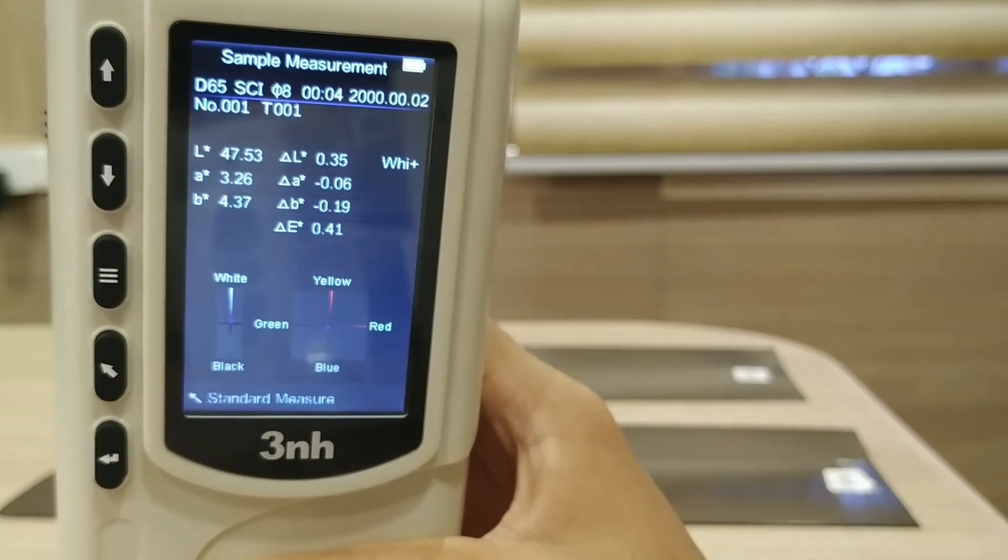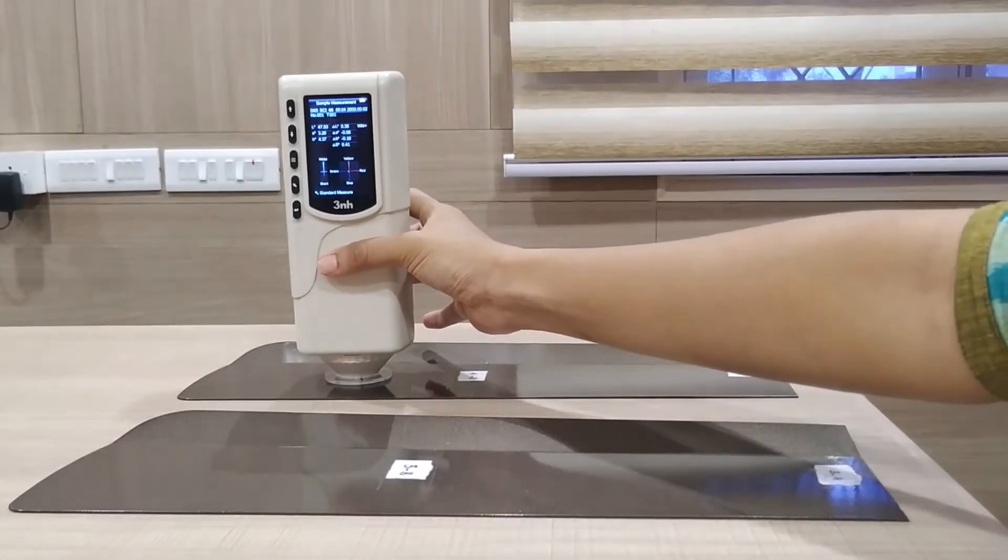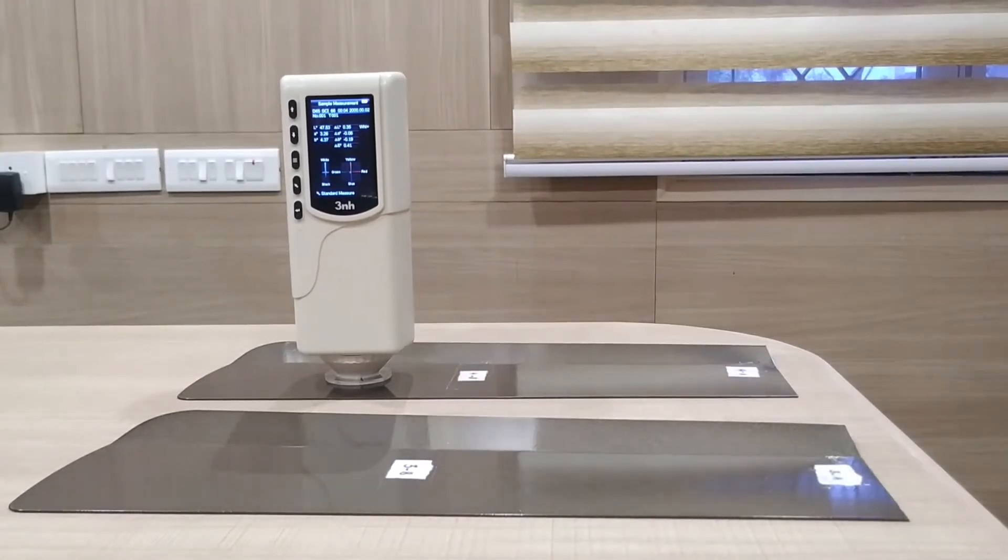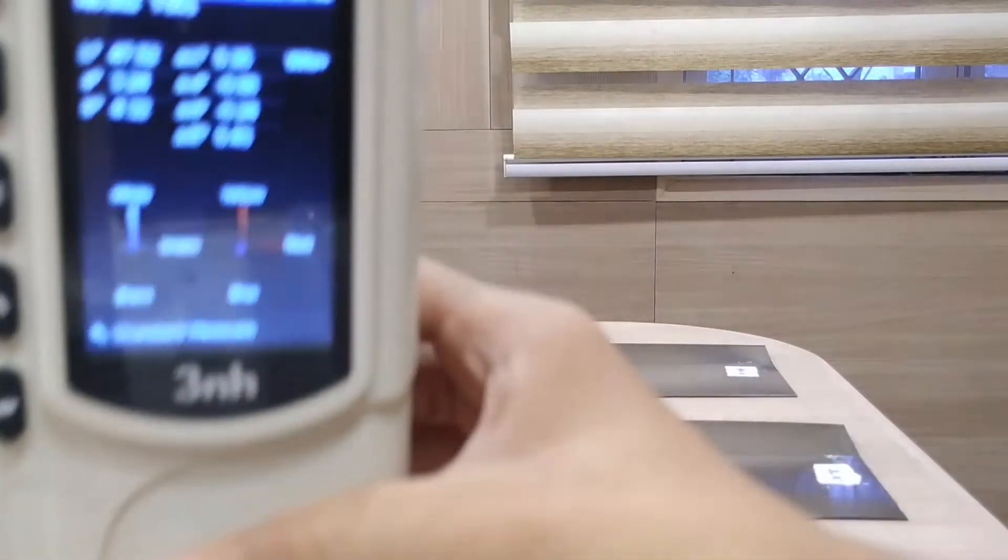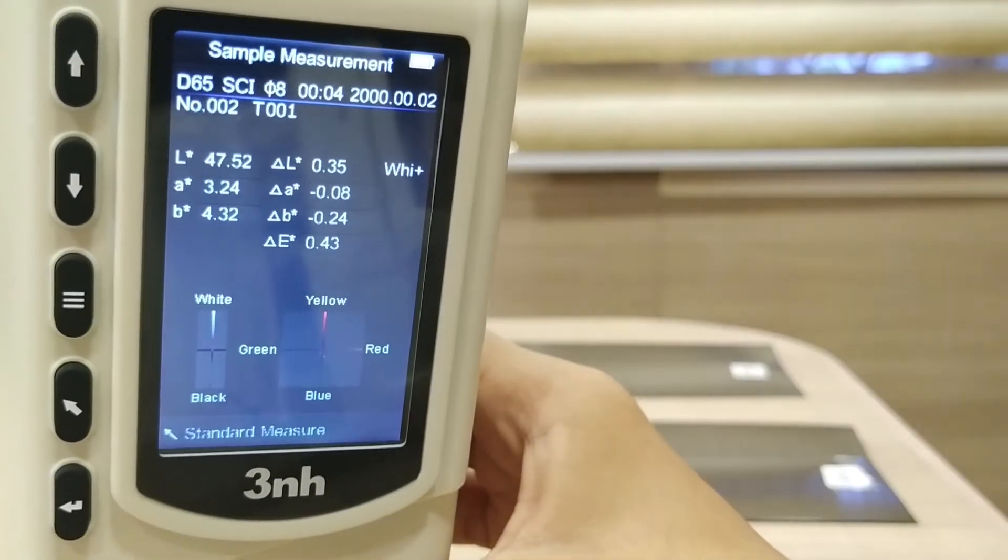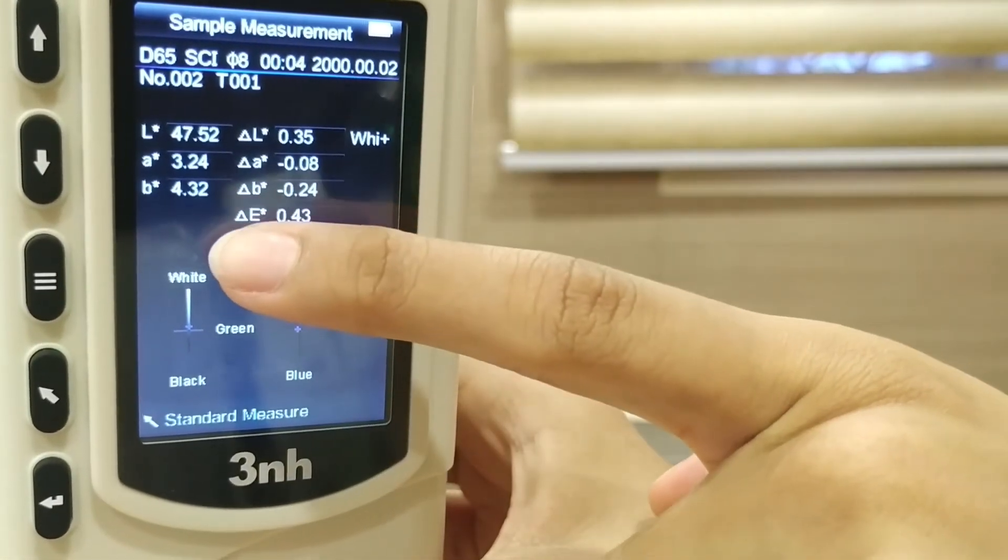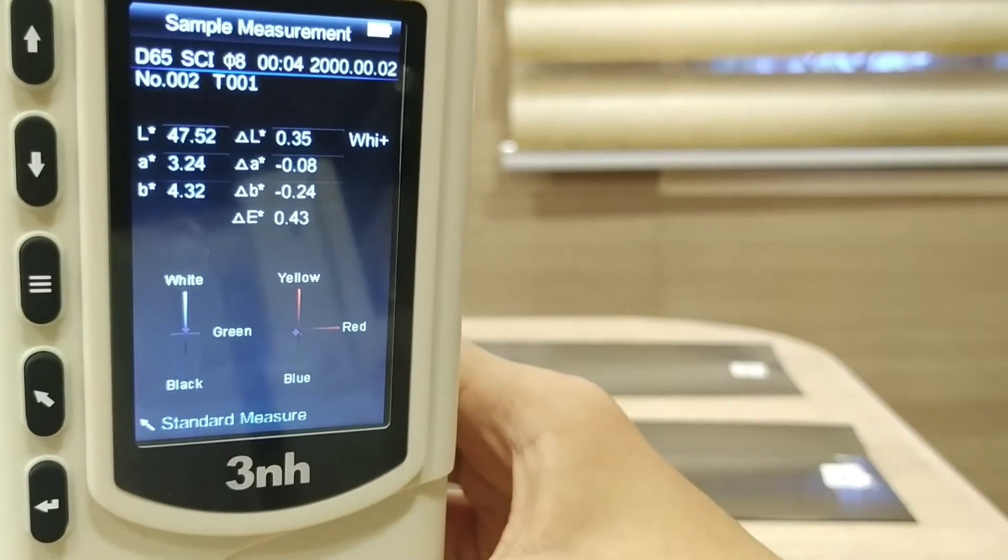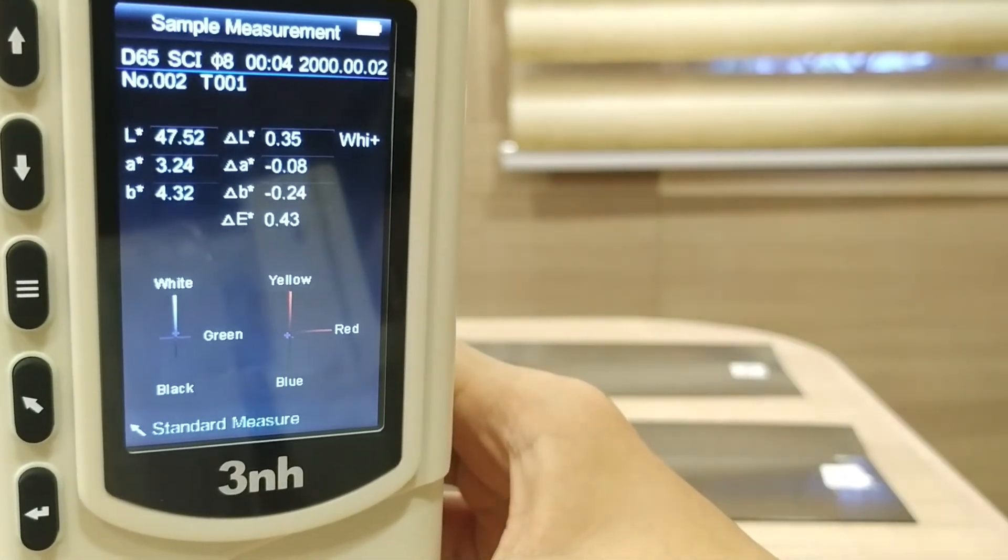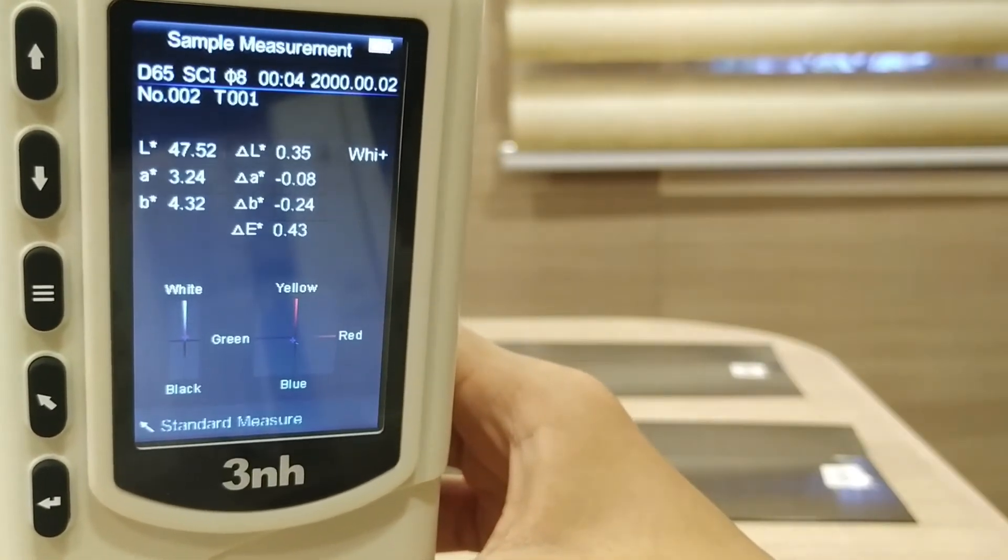Now let us measure our second sample. For our second sample you can see that the delta E value is 0.43, which again is accepted in all industries. Therefore, our sample number 2 has passed the color test.